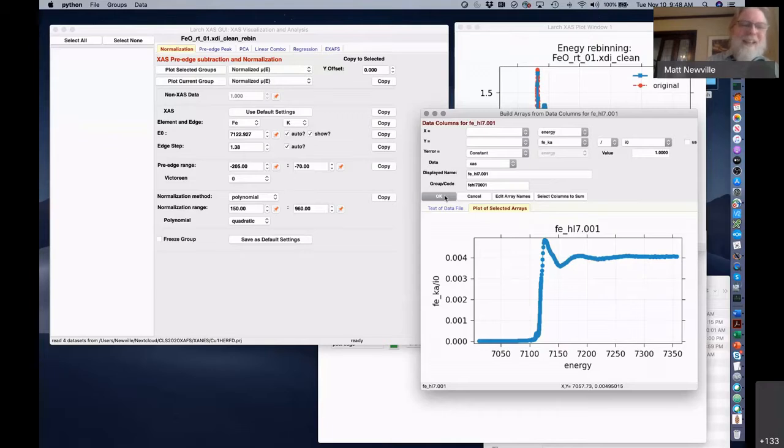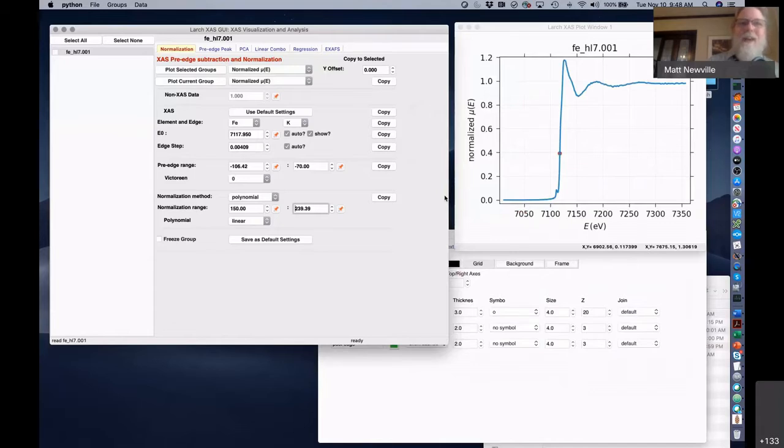But I'm not sure that that's really what's happening if the XAFS oscillations for fluorescence data are higher than for transmission data. It could also be that the normalization isn't done quite perfectly. That's usually a 5 or 10% effect, not a huge effect. So I'm not sure. I guess I would want to know more details of what the materials and what the spectra are. Sure. Yeah, I mean, it's a very specific one.